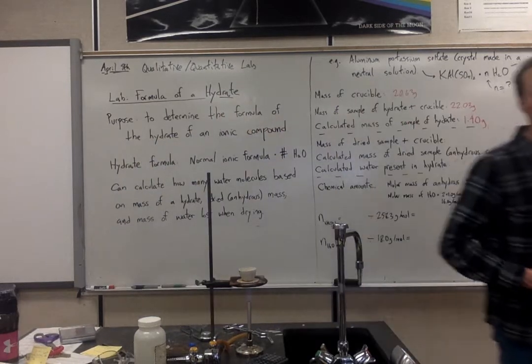I don't know for certain if this happens, but I suspect that if you leave the dried out salts out in the open air, they might absorb water, and that's my concern.